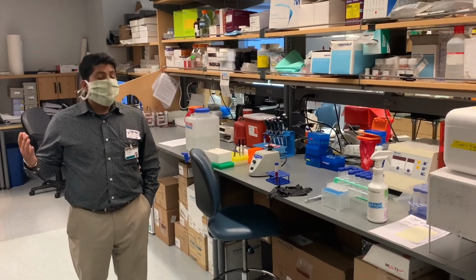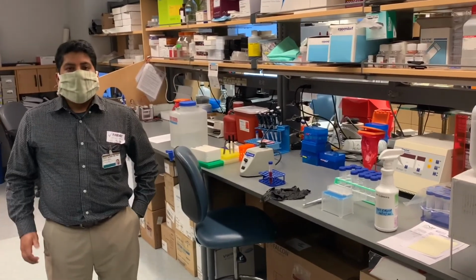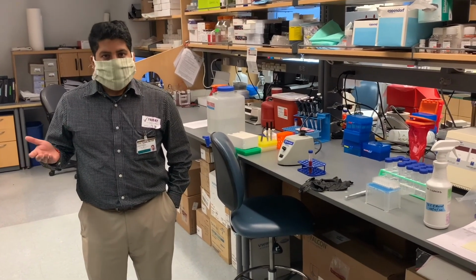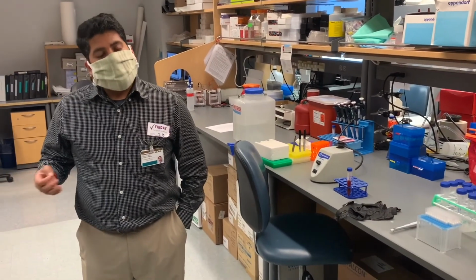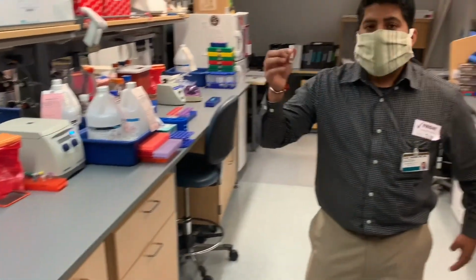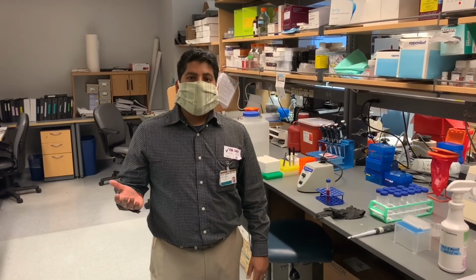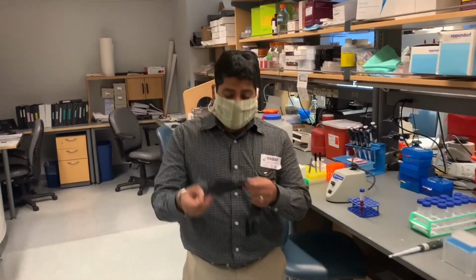All right, well, this is one of the many bays in our Pulmonary Vascular Biology Lab. The bays are where we do all of our wet lab work. What that means is we run reactions with cells, tissue, proteins, RNA, and DNA. Because these particles are so small, we can generally run them in very, very small tubes. Okay. Well, let me show you some of the tools that we have in our laboratory. But before we get started, safety comes first.